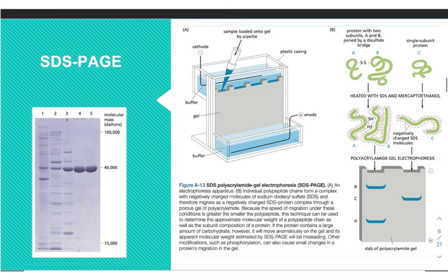One of my favorite biochemistry professors told me this analogy about protein gel electrophoresis: think of a chain link fence. If you've ever been to a park with a baseball field, there's one near my house, and it's got a chain link fence with little holes in it. Imagine throwing a baseball at that. It's probably not going to go through, right? Now imagine throwing a golf ball at it. Easier to get through, right?